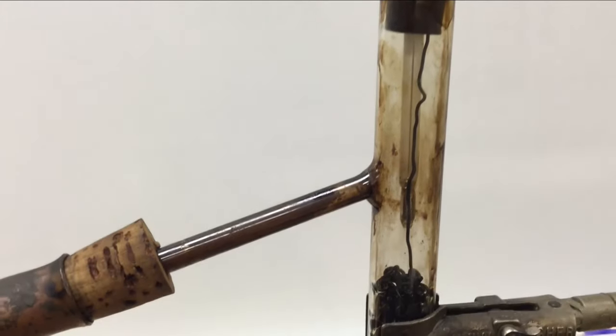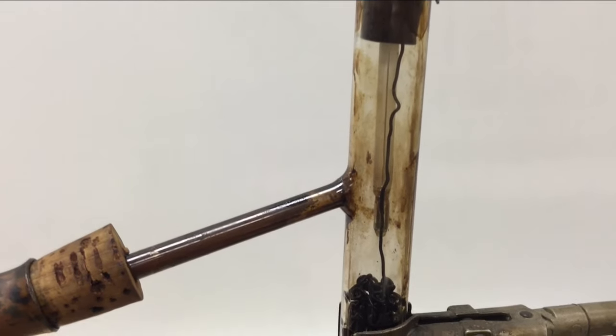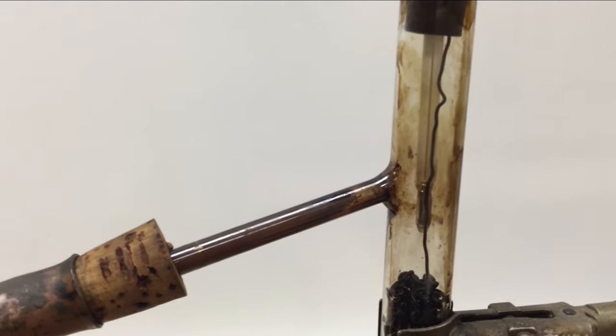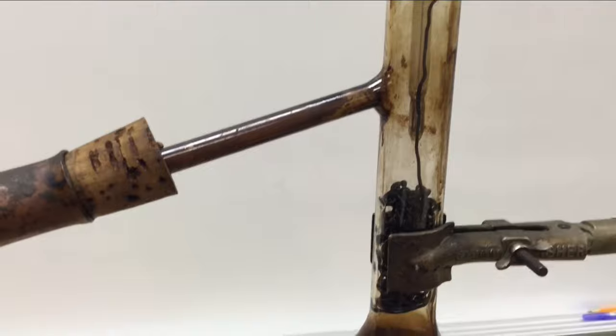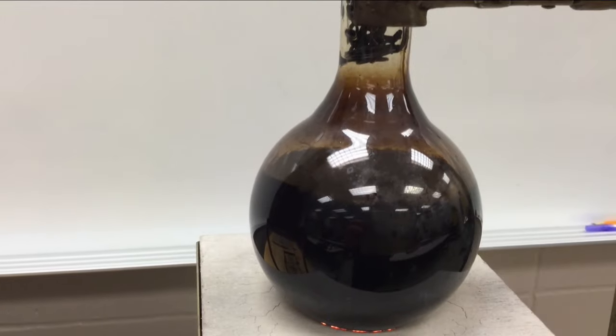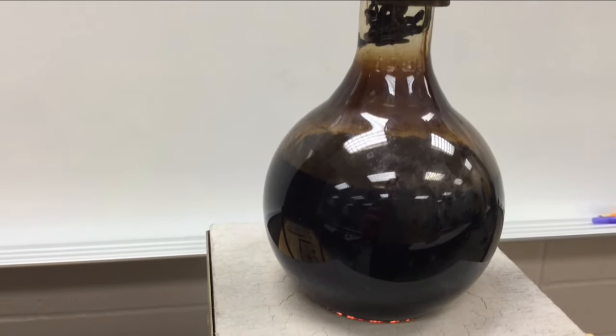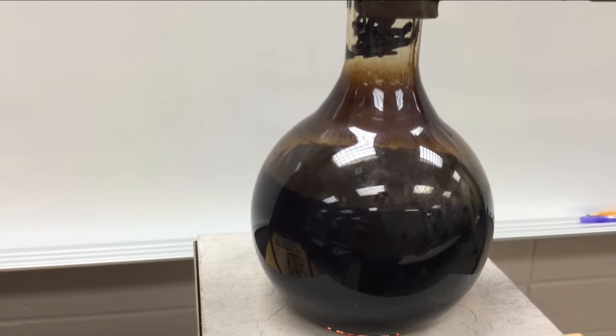So our thermometer is really close to 450 degrees right now. So we'll take a sample at 450 degrees. I don't know if you can see the gases at all in the flask. You can see some condensation happening where the thermometer is at. You can see the bulb of the thermometer in relationship to the tube that's going to the condenser. You can see the jack chain in there, and the oil itself, it's boiling. So that oil is a lot hotter than 450 degrees. It's just the vapors coming off of it, or that's where they're at.